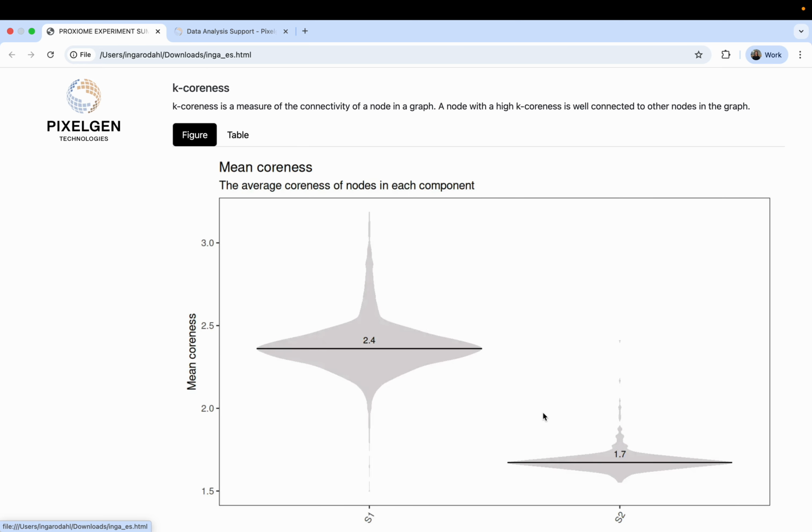Then you can also look at what these clusters and cell types are expressing based on the abundance. Here you find each of the clusters with the cell type annotation. For example, you can see that the T cells are indeed expressing CD3. And in this list, you can find your favorite markers to annotate and to double check the annotation.